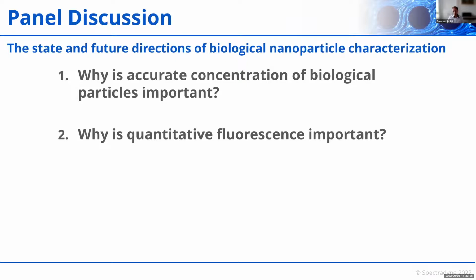Right. Any thoughts to add, Dr. Jones? Yeah, I'd love to ask, and I think I know the answer to it, but given what Edwin was saying about the heterogeneity of the material that we're looking at from biofluids, presumably because you're analyzing these at a single particle level, there will be an ability to gate populations and interrogate the heterogeneity in that way, in a similar way that we do with flow cytometry, to say, take the largest 10% of the particles detected and see if the relative intensities of, say, FITC or GFP or PE are equivalent to the distributions of those fluorophores on a mid-range size detected by MRPS.